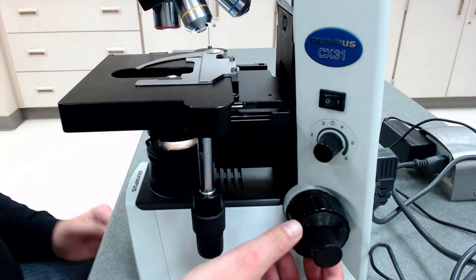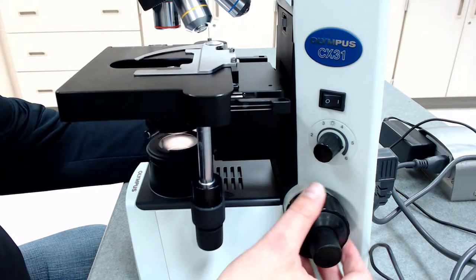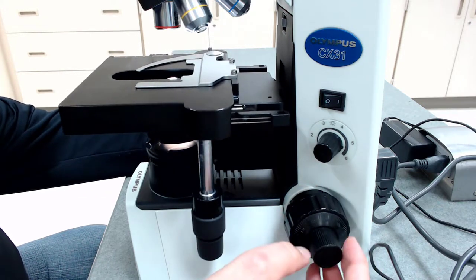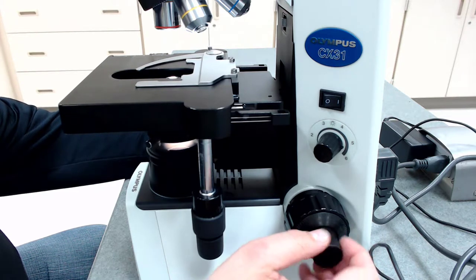So you have the coarse adjustment knob. And notice as I turn this larger portion on the inside, the stage moves up and down a lot. On the outside, you have the fine adjustment knob. And it's moving, but it's barely moving. So as I really get it spinning, you can see a little bit of movement there.